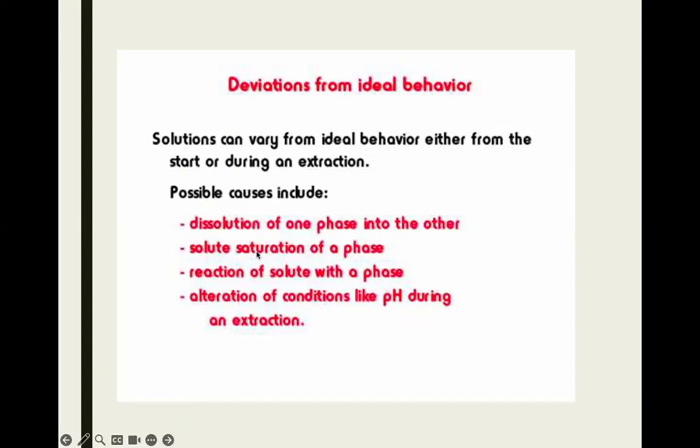And there is a possibility that you miscalculate, so you have solute saturation of a phase, and there is a possibility of reaction of that solute with the solvent. So these are things we have to consider before we do solvent extraction. We have to study if there is any cross reaction between the solute and the solvent that we use, and whether there is any possibility of reversible reaction. You have to check all those things before we can do the solvent extraction.